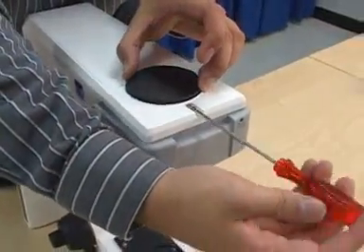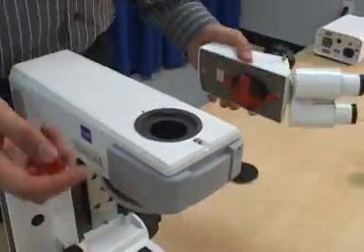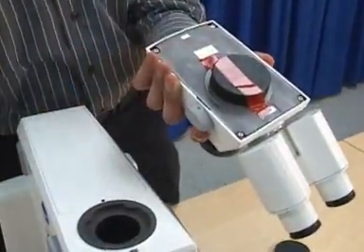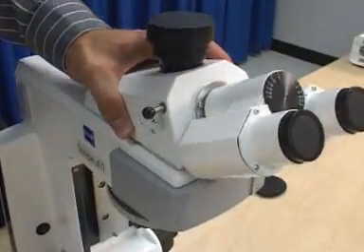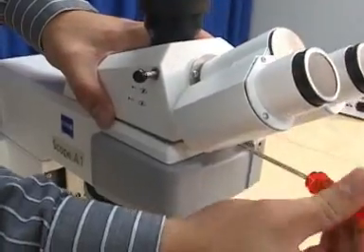Remove the dust plugs from the binocular photo tube and attach the tube to the upper part of the microscope. Tighten the fastening screw with the ball-headed 3mm screwdriver.